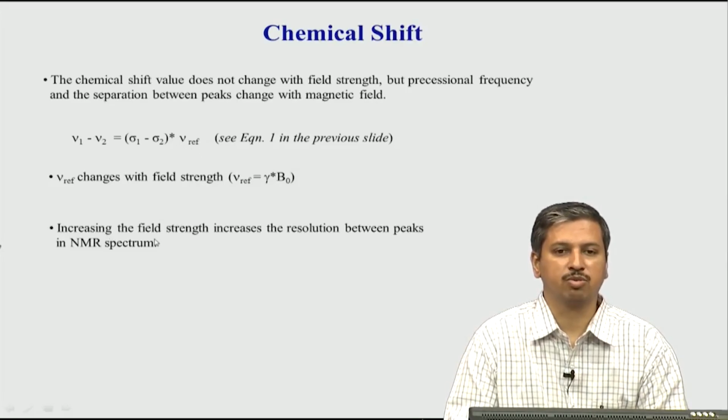So, why is that so important? The point here is that when I increase the separation between the peaks, what I am doing is increasing the resolution between the peaks. That means I am separating the peaks more and more if I go to higher and higher magnetic field.